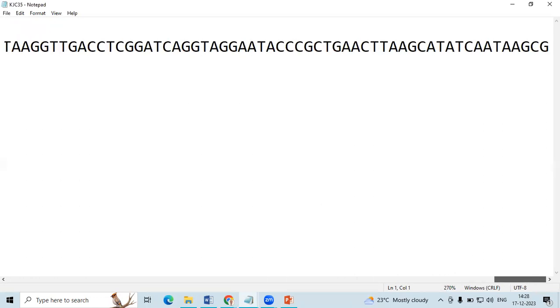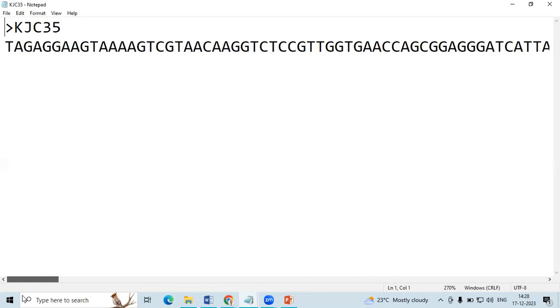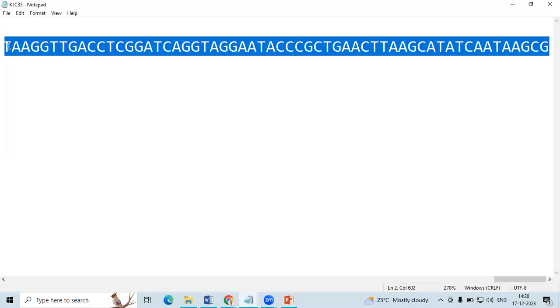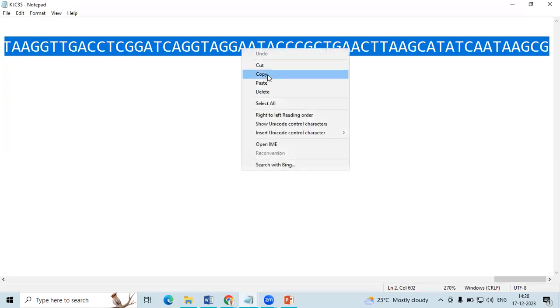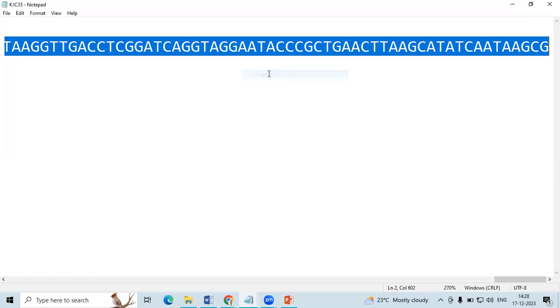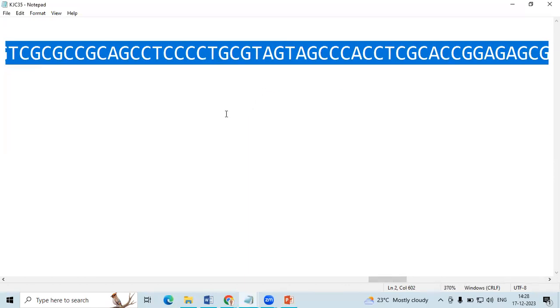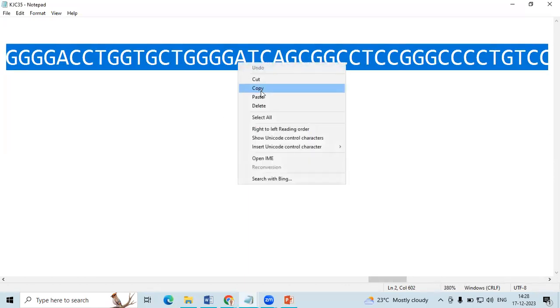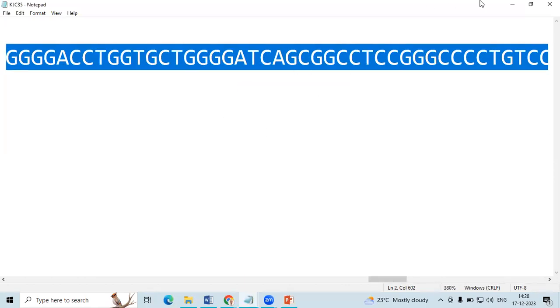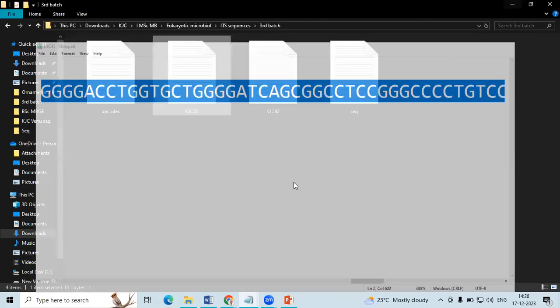So what I am going to do, I am going to subject the sequence to BLAST analysis, selecting the entire sequence length, copy the sequence. And after copying, I am going to subject the sequence to BLAST analysis.